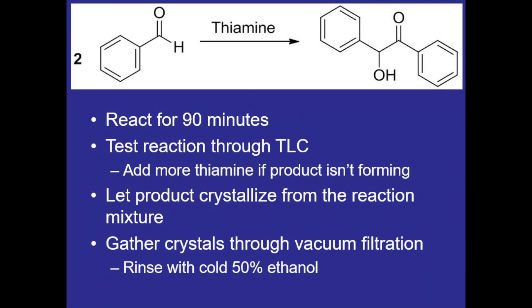At that point we'll rinse that solid with cold 50% ethanol which is to help remove any of the benzaldehyde that would have been left over from the reaction.